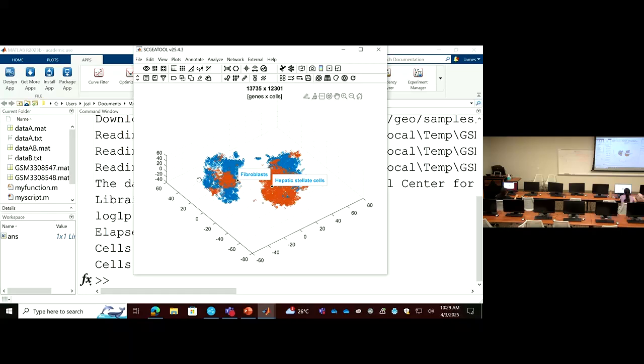So this is the one you downloaded from the channel. Okay. So I show you this example side by side with this. Let's see which cell type we should use. I don't know the example.